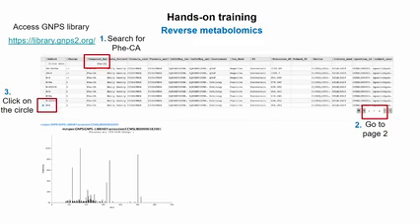So what you generally want to do, when you really care about the distribution of this particular molecule, is what Vincent just said: look at the spectral quality, because it's public data and not all of it is equally useful. And then also try multiple, because if you match against public data, some of them are also TOF, some are Orbitrap, with different collision energies. So you want to try different things and then investigate all the matches you get in the context of what spectrum you used. Okay? Hope that makes sense.